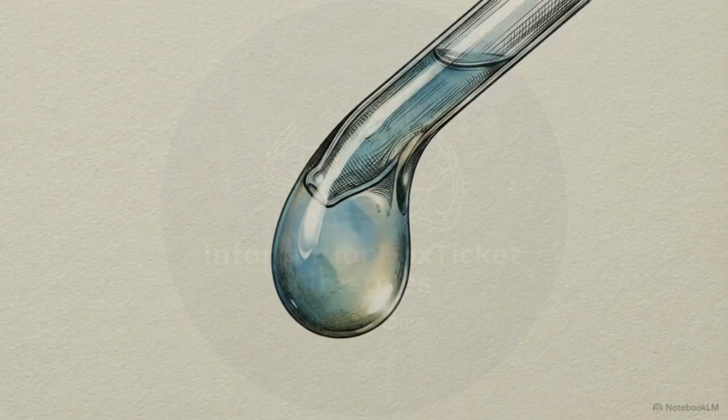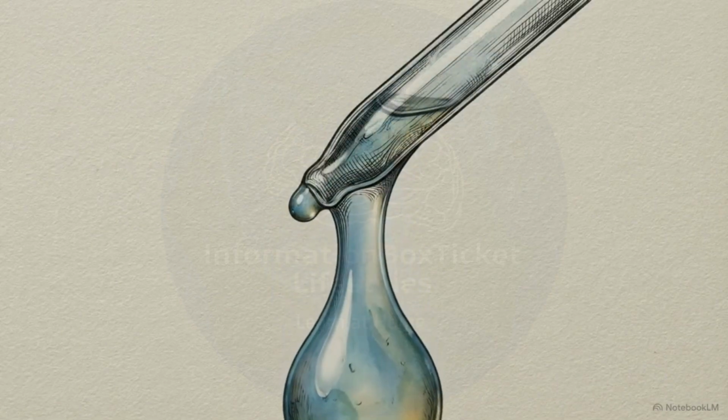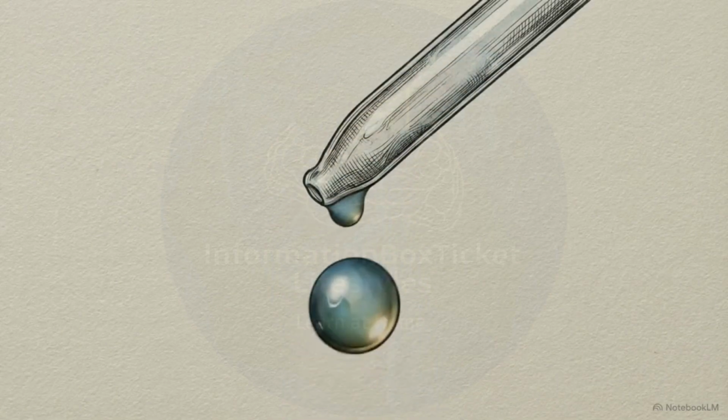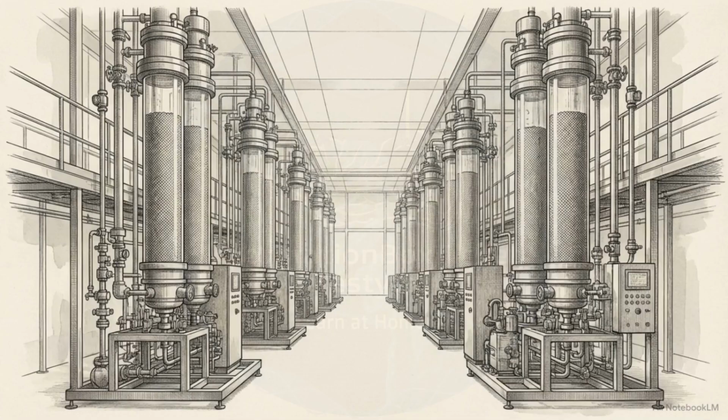This gentleness has heavy logistical costs. The process is slower and yields lower raw resolution than high-pressure systems. It also requires expensive, routine maintenance to prevent catastrophic clogs or biohazard leaks within the complex fluid lines. But that trade-off is exactly what allows the pharmaceutical industry to safely scale up the mass production of life-saving therapeutics.